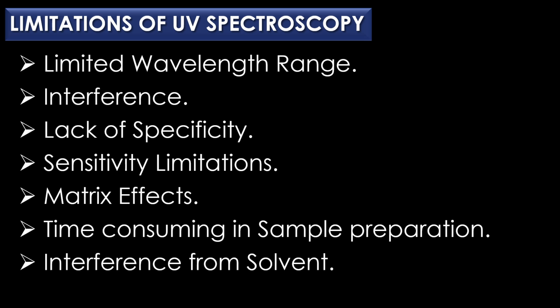Sample preparation. Sample preparation can be time consuming and may require special techniques, especially for solid or heterogeneous samples. Finally, the seventh limitation is interference with solvents. The solvent used to dissolve the sample can also absorb UV light, potentially interfering with the analysis.